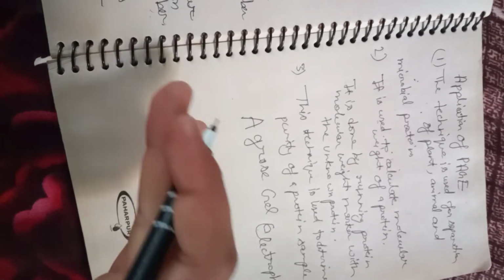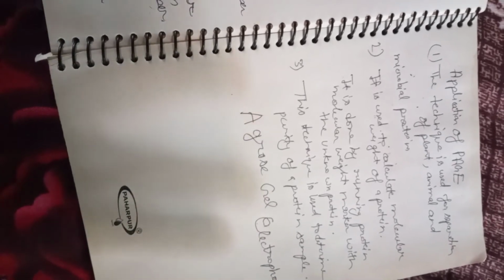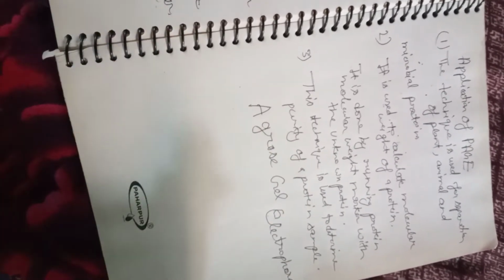In agarose gel electrophoresis, agarose at a concentration of 1 to 3% in a suitable buffer is used. Agarose gels are prepared by suspending dry agarose in a suitable buffer such as Tris-EDTA buffer, and then the solution is boiled until a clear solution is obtained. The solution is poured in a gel caster and allowed to cool. A plastic comb is inserted in the agarose solution so that wells are formed. When the agarose solution cools down, it forms a solid gel.